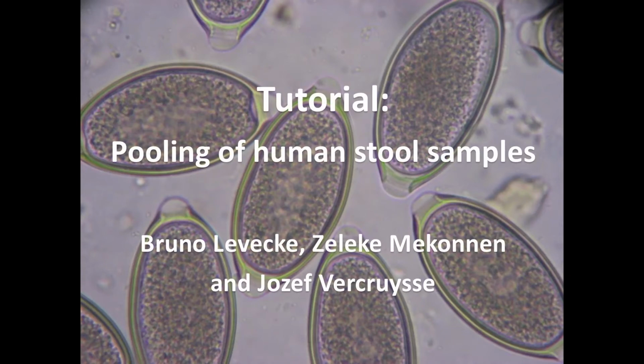Tutorial: Pooling of human stool samples. In this tutorial we will demonstrate how to pool human stool samples for rapid assessment of both intensity of soil-transmitted helminth infections as well as drug efficacy.